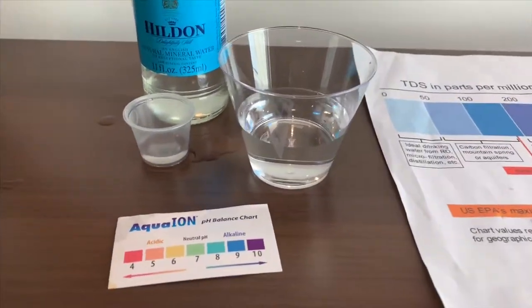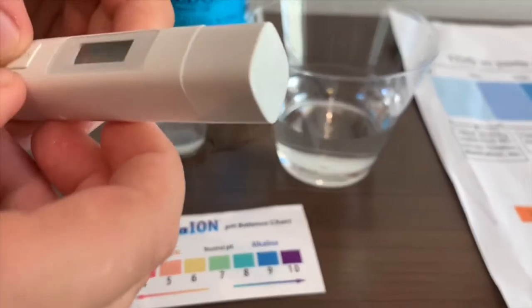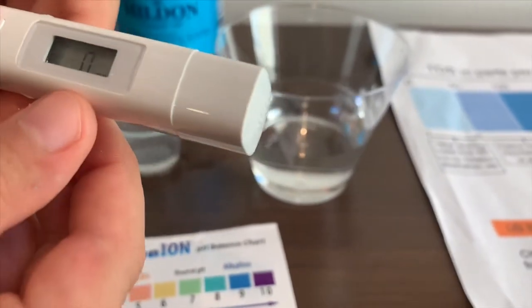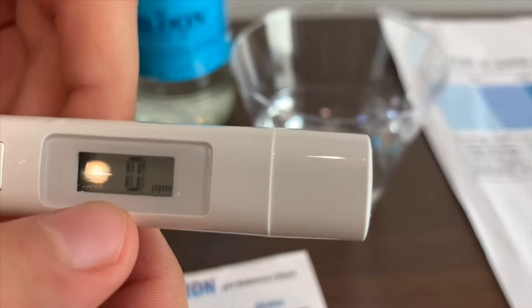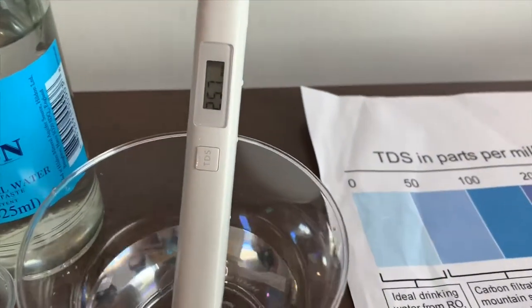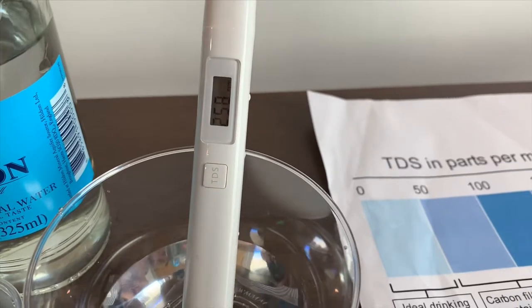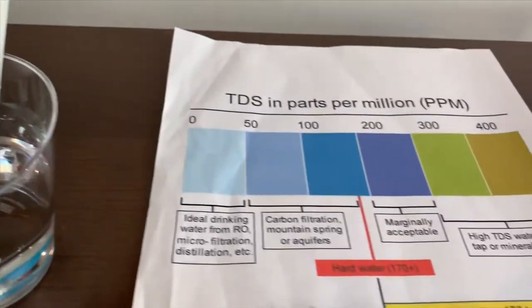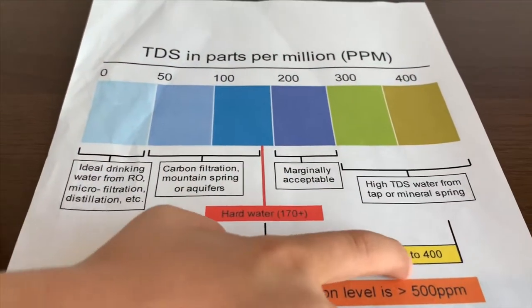First, we're going to test the TDS level. Turn on the TDS tester, make sure it says 0, and let's put it in. 258 - that is average tap water.